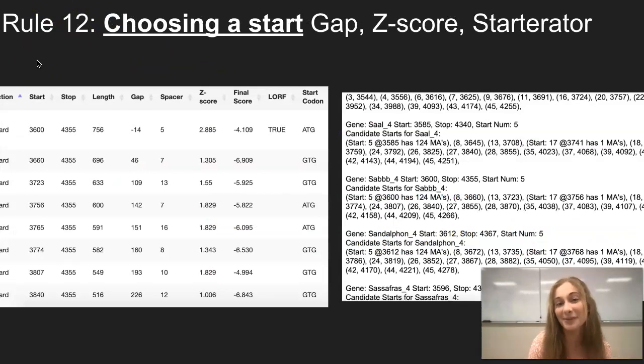Rule number 12 is very similar to rule number 4 as it helps us choose the best start for each gene. But now we are looking at the gap, z-score, and starter rate. As we talked about before, we are looking for the smallest gap. So the negative 14 overlap over here is the best option.